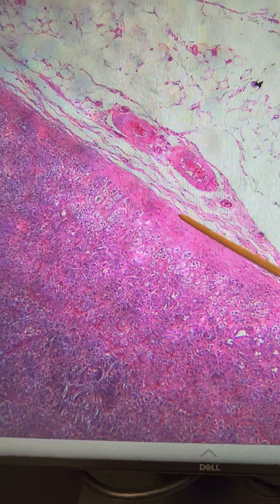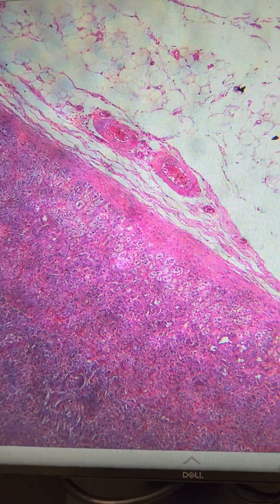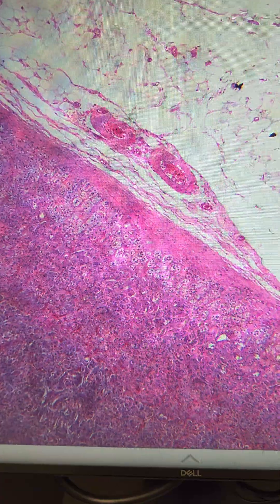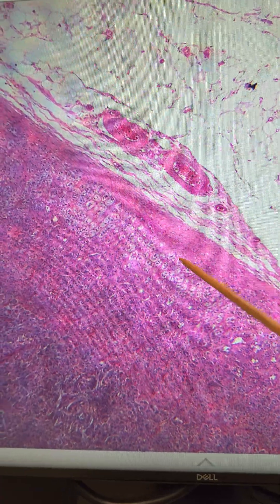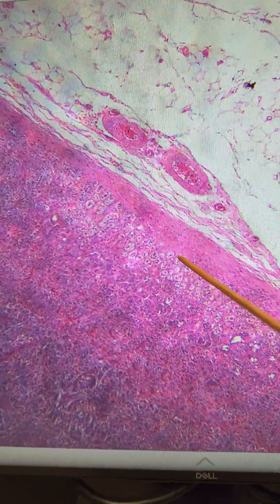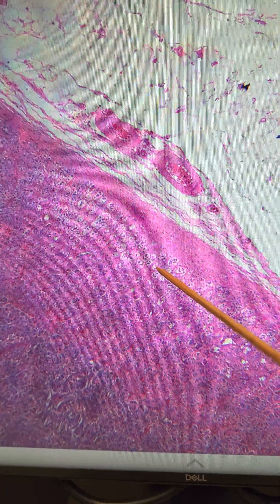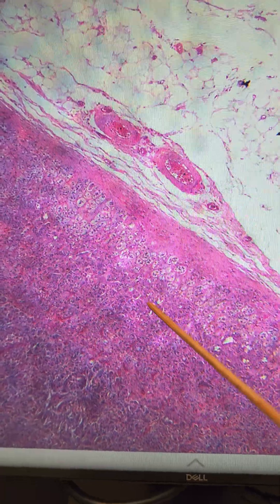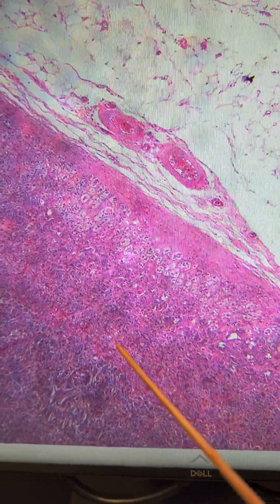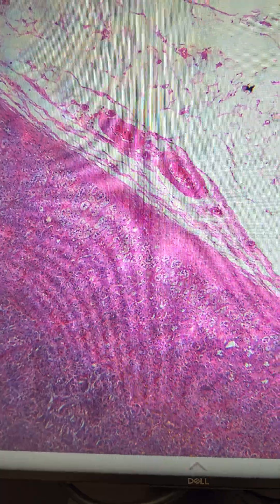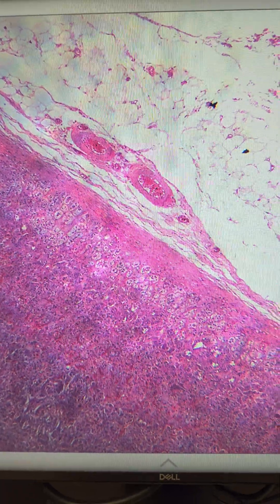Just deep to this connective tissue capsule, which is often found surrounding organs, we can see the three layers of the adrenal cortex: the zona glomerulosa, the zona fasciculata, and the zona reticularis. Let's take a closer look at these three layers.